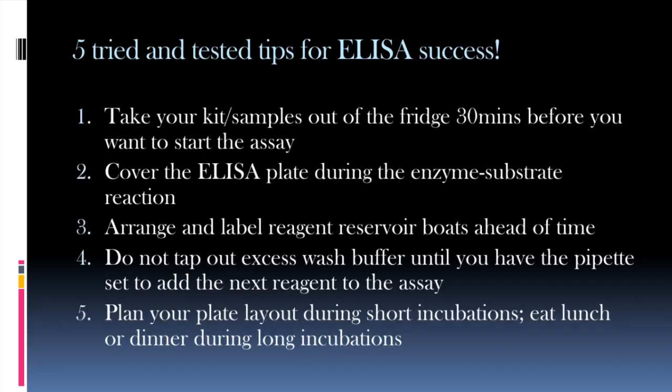So the very last thing I want to do is to give you some of my own tips for ELISA success. I've been doing ELISAs for a few years now, so I have a couple of tricks that aren't necessarily written in the protocol, but come in handy when planning an ELISA assay. The first one is to take your kit or your samples out of the fridge or freezer 30 minutes before you want to start the assay.